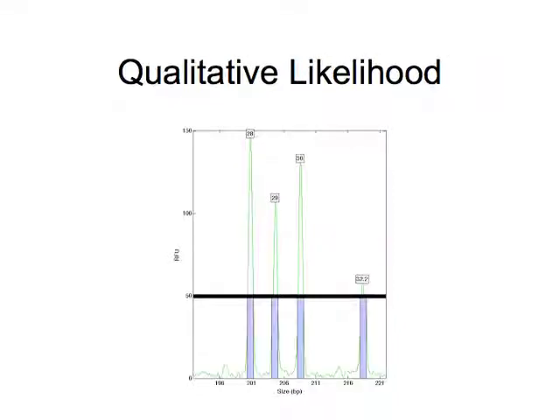Next slide. Imagine, however, that we had some sort of qualitative DNA assay that could reliably give us the alleles that were contained in the data. So this is not looking at quantitative peaks in any way. One could imagine that sometimes a threshold procedure could do this, but we are trying to detect only the presence or absence of alleles.